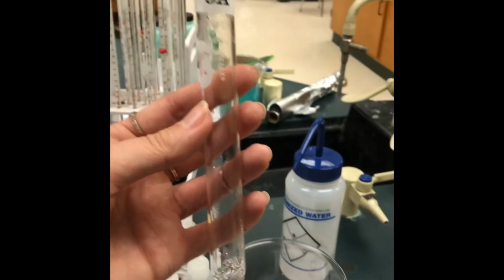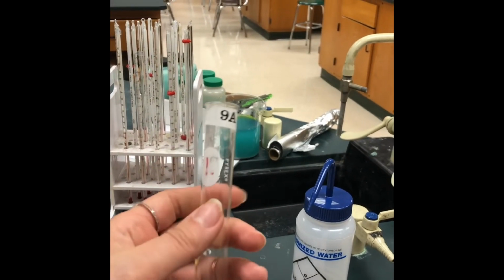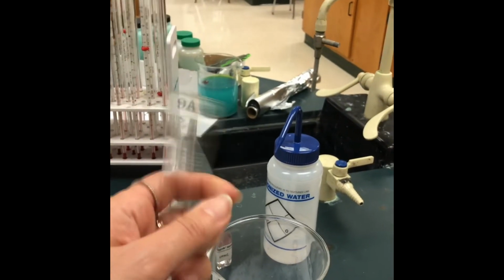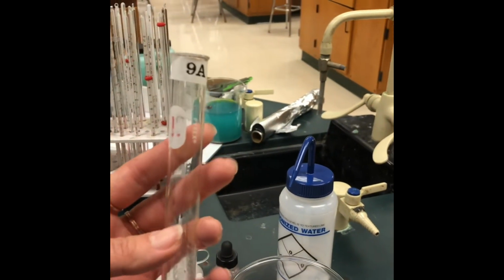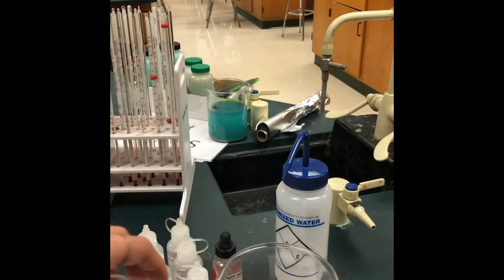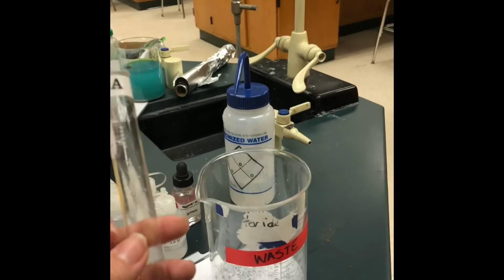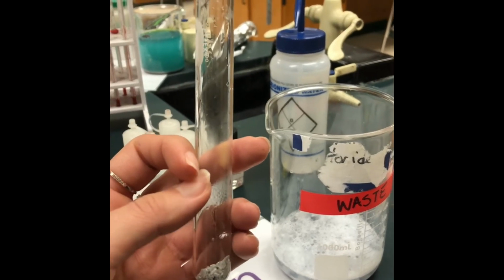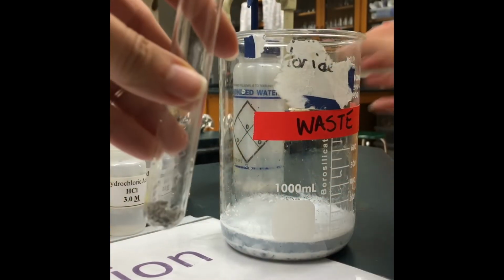So if you could think of a few things that would help you dislodge this. A spatula, that would be really good. A stirring rod would be great as well. And also something that might be the best thing is to grab one of the deionized water bottles and put a little bit of water in here, as you'll see me do in a second, and then stir it around and dislodge that into here. So I'm going to demonstrate that for you right now. And it's okay if a little bit of the particles get left on the test tube at that point, but you don't want to use your scrub brush just yet, because the scrub brush is just going to get all dirty.